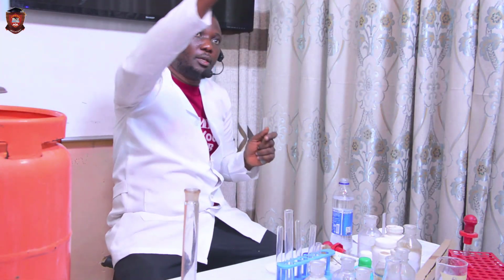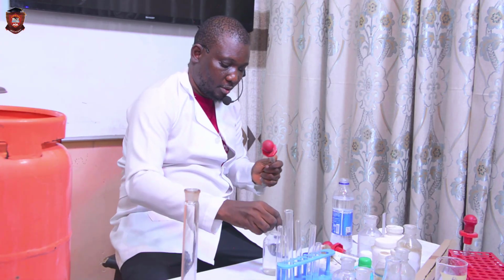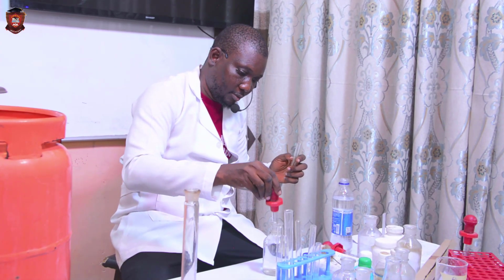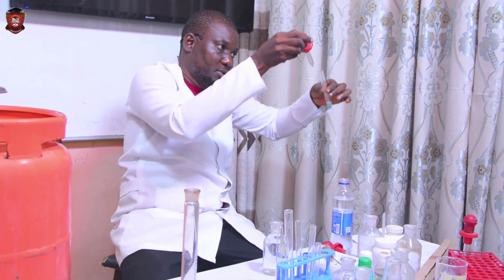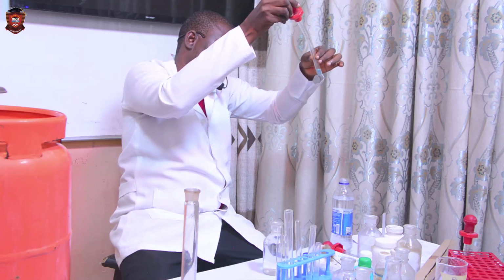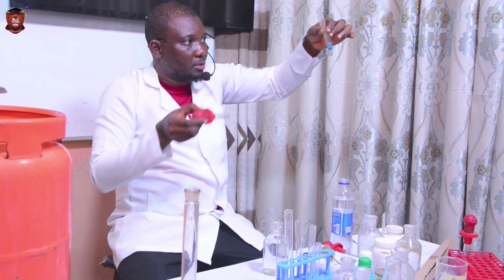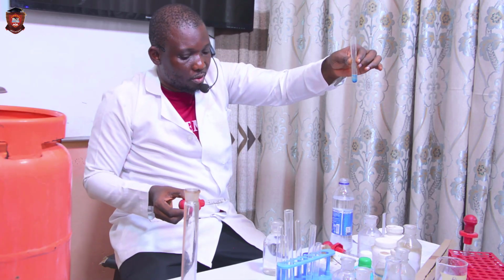Okay. Use another dropper. Where is our NaOH? Let's add a drop. Maybe if you try one drop, if you didn't see anything, you try two. Are you seeing something? This is a drop. So what did you see?